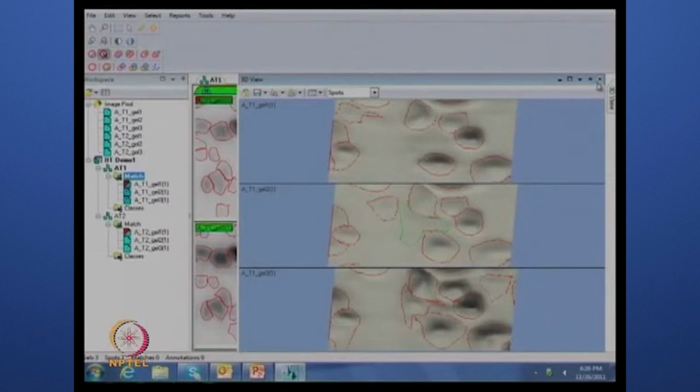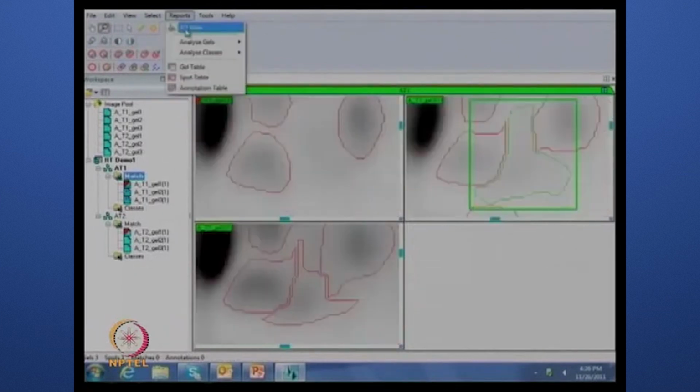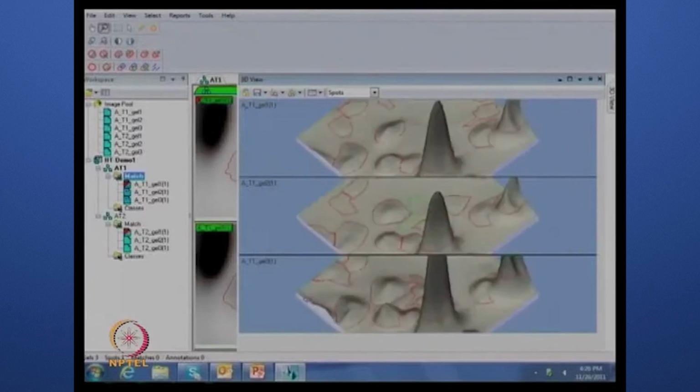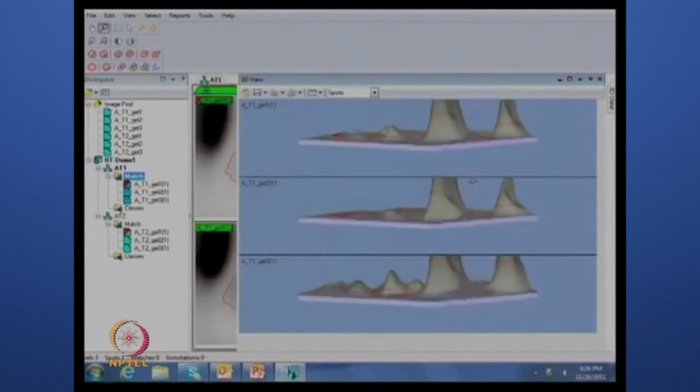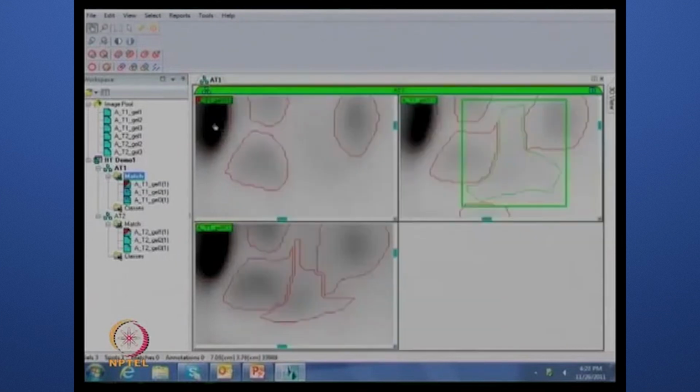Otherwise, I can visualize this, I can zoom more so that one can see more. Yes, so now these are the intense spots which we are visualizing. The other boundaries are marked from the 75% from the top. Now let's zoom out and go back to the whole gel.